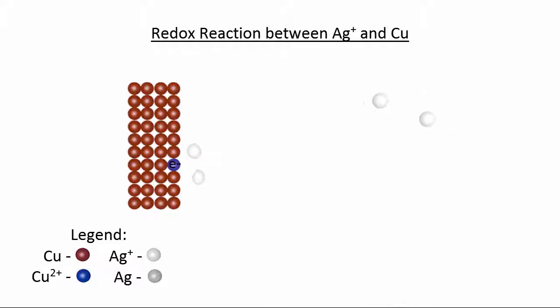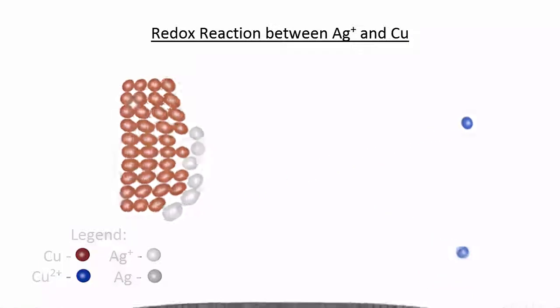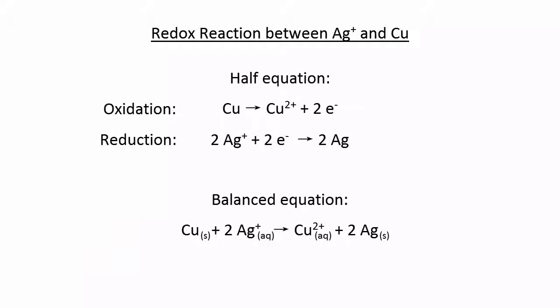The principle of the experiment is based on the redox reaction between Ag and Cu. When the copper is inserted into the solution, Cu oxidizes to form a blue solution of Cu2+, while the Ag+ is reduced to Ag and deposits itself on the surface of the copper wire as small and spiky silver crystals. The balanced chemical equation for this reaction is Cu + 2Ag+ gives Cu2+ + 2Ag.